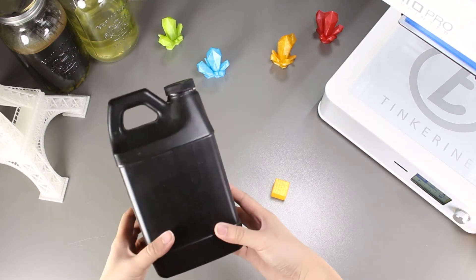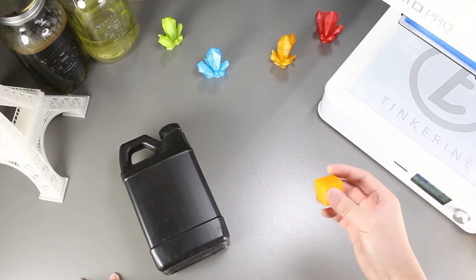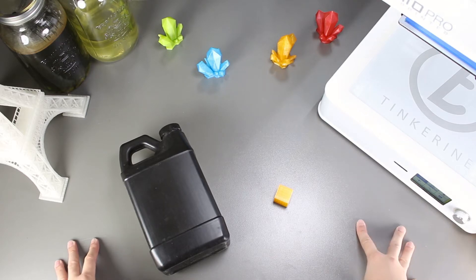Welcome to another episode of Tinkerine Experiments. Today we are going to try to do an experiment that shows bacteria breaking down PLA. PLA is biodegradable but we haven't really seen how it is broken down, and we are hoping this experiment will show it.